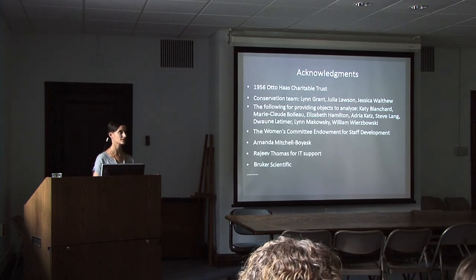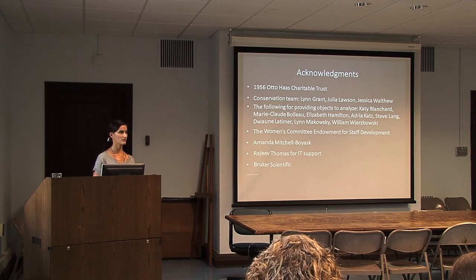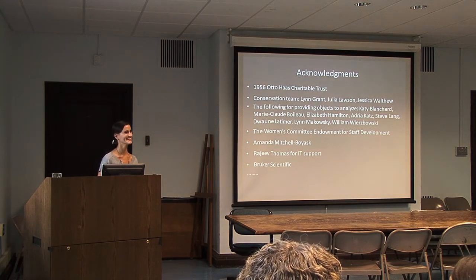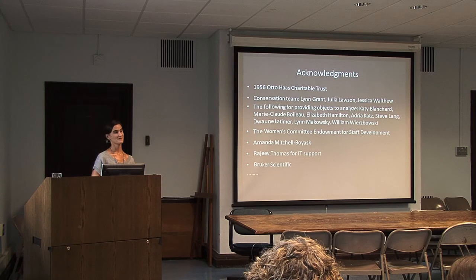What is the beam size? It's a few millimeters, and I have that documented with the equipment, but if you want to know more, I can email that to you. Well, I'm going to be at the workshop. Okay. But it's about, probably about half a centimeter, but I can look that up specifically.